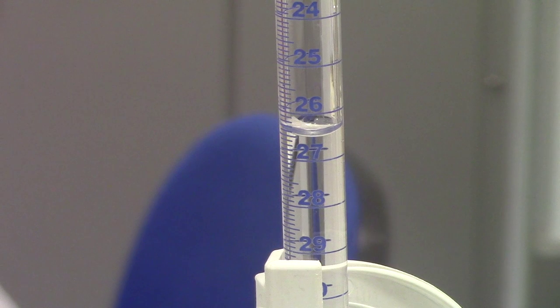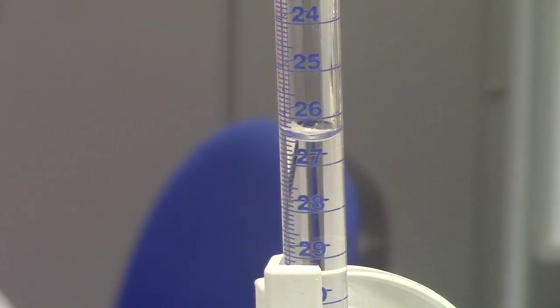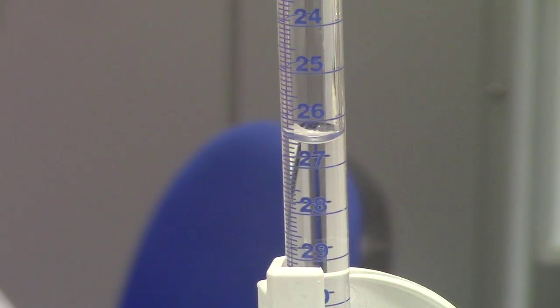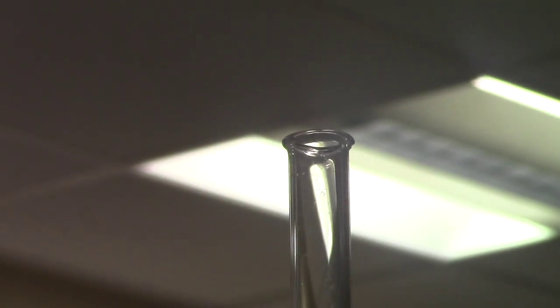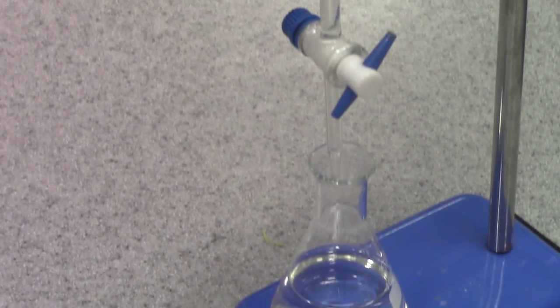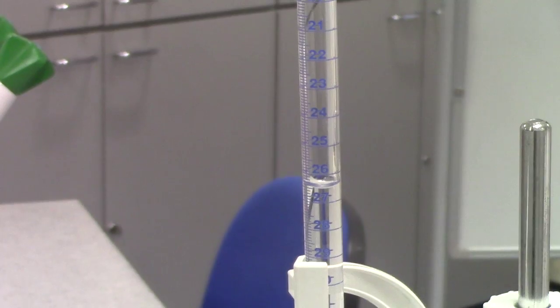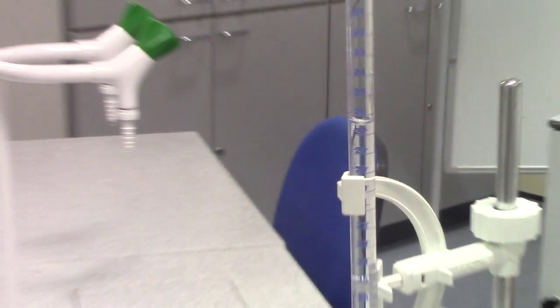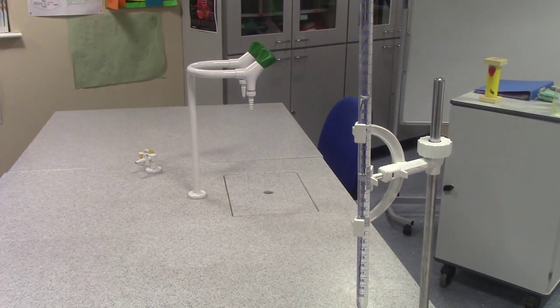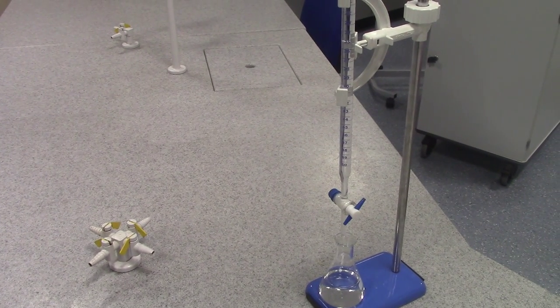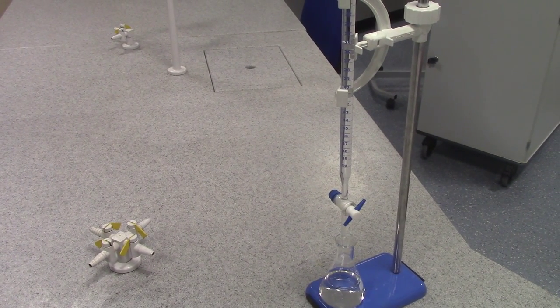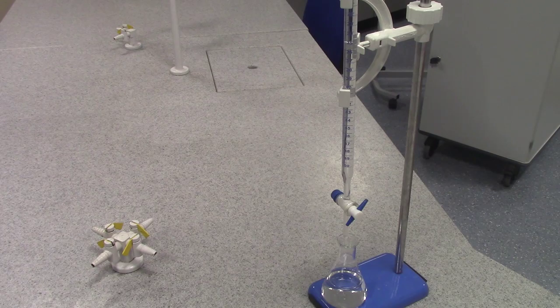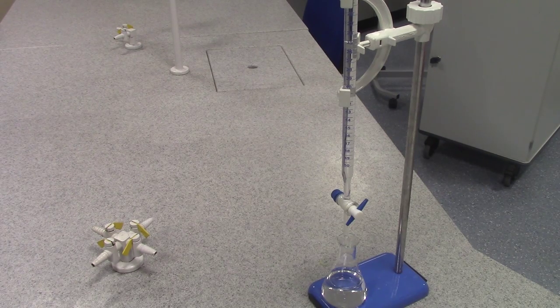That's how we use a burette. To recap, the main sources of errors are reading from the bottom of the meniscus, removing the funnel before you start, checking for any air bubbles and getting rid of them, monitoring your reaction carefully so you don't miss the end point of the reaction, and for some titrations there might be other sources of errors. For example, some reactions might depend on a particular pH, in which case your titrant might need to be correctly buffered in order to see the end point accurately. Thank you.